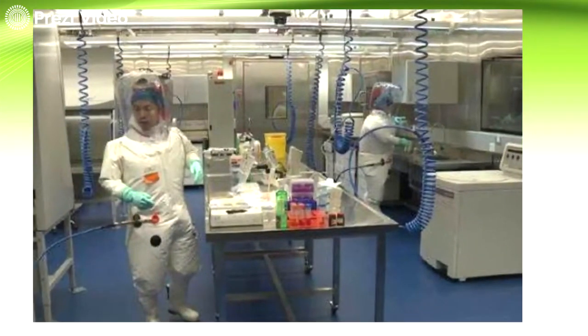Okay? So, ito yung example of a biosafety level 4. Yan. So, makikita mo, yung mga tao, may mga nakakonect na blue sa kanila. Ito yung kanilang mga source of oxygen. Okay? So, positive pressure suit yan. Okay? Yan ang example of a level 4 containment.